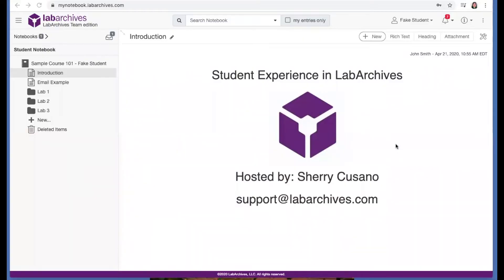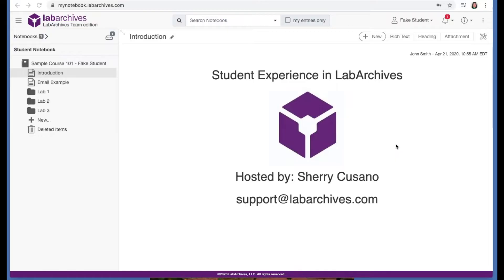This video will cover the experience as a student in LabArchives. LabArchives is an electronic lab notebook. We are cloud-based. This means you can securely access your lab notebook online and receive feedback from your instructor.